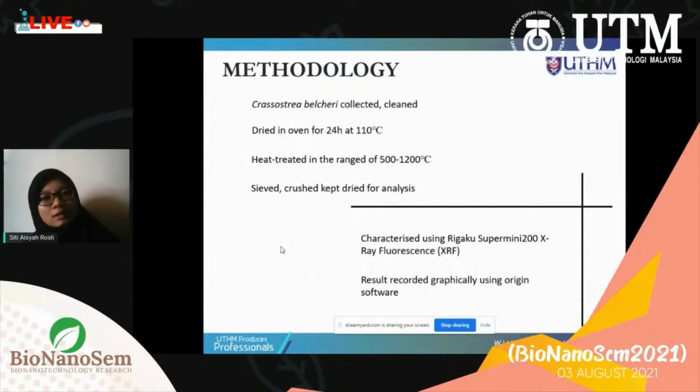The dried oyster shell was heat treated in the range of 500 until 1200 degrees Celsius, and then it was crushed, sieved, and kept dry for analysis. The sample powder was characterized using Rigaku Supermini200 X-ray fluorescence to determine the chemical composition in our waste oyster shell, and then the result was recorded graphically using Origin software.